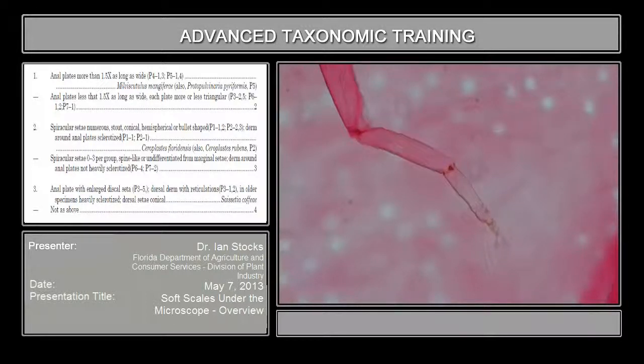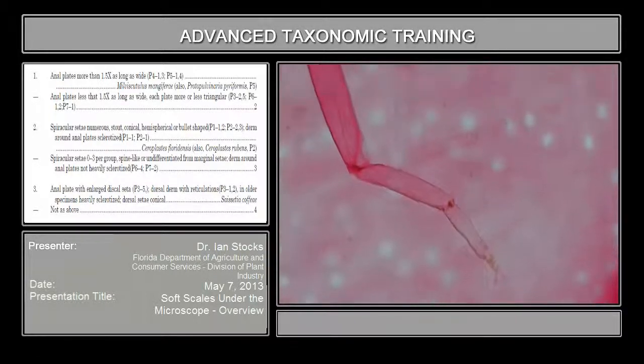There's another case where they have that, but the leg is still more or less fixed in one place. Okay, so that's tibio-tarsal sclerosis without articulation. And then in one of the other slides we're going to look at, there's no sclerosis there at all, and the leg is essentially one fused long unit. Okay, so we always will have to evaluate that condition.